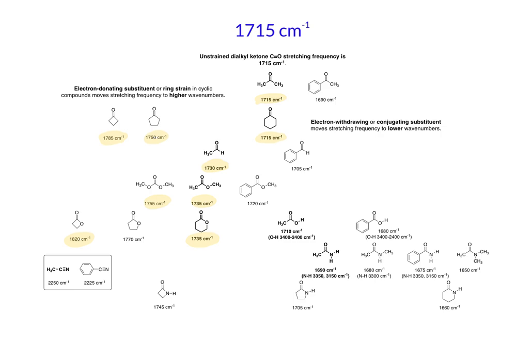In the case of an aromatic group that is conjugated with the carbonyl, that slightly diminishes the bond order of the carbonyl. Likewise, the nitrogen of an amide conjugates with a carbonyl, very slightly decreasing its bond order. This is a chart that is worth printing out and posting next to your local infrared spectrometer.